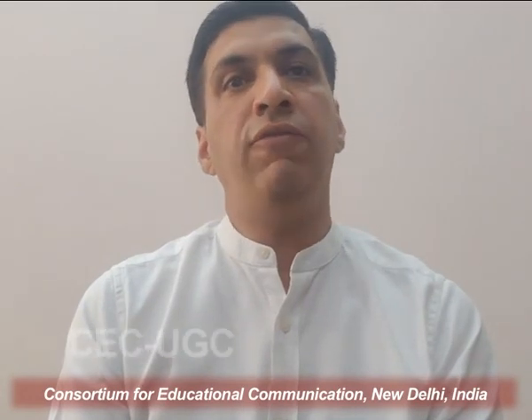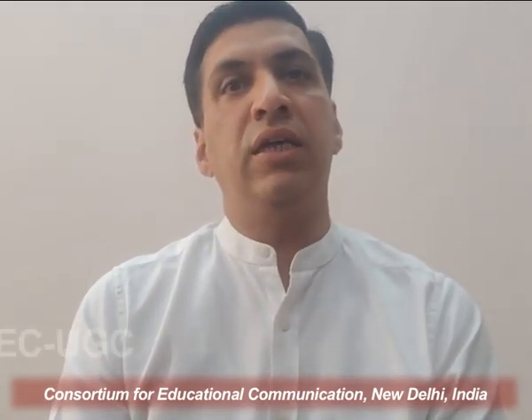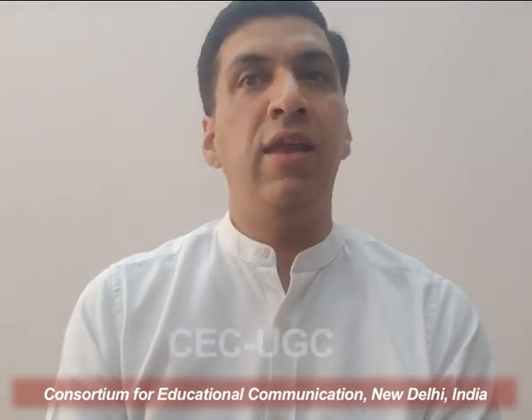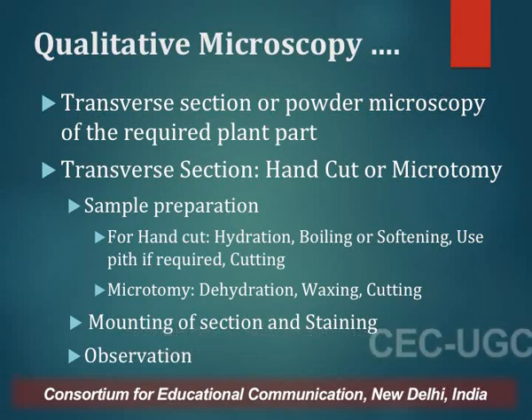Many a times it happens that the plant material or the sample material is too thin or too small to be held between the fingers. In such cases, we increase the surface area which we are holding, or you can say we increase the surface area of the cutting surface, and then we cut the transverse section. Now this is normally done by embedding the required plant part or the sample in a pith. And normally on laboratory scale, we use a block of potato as a pith.